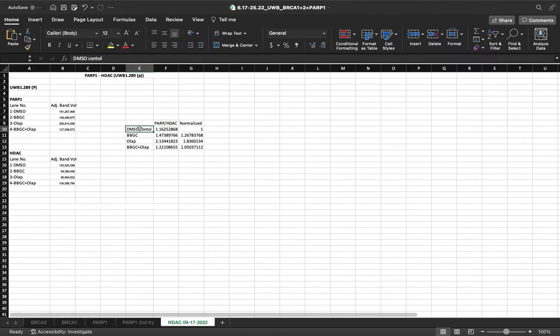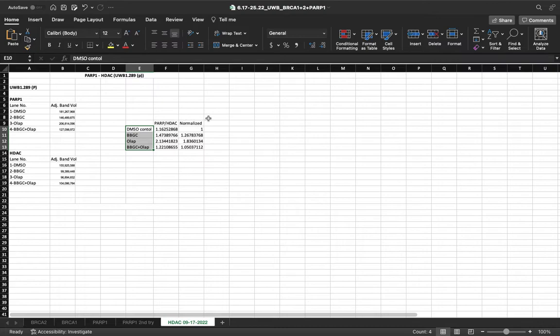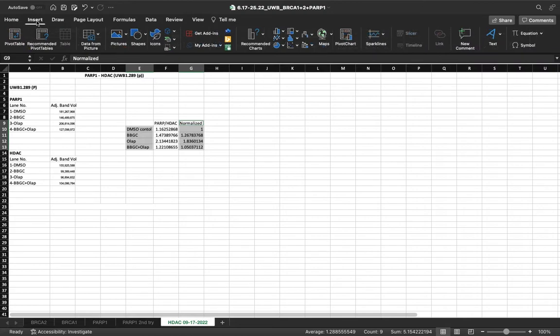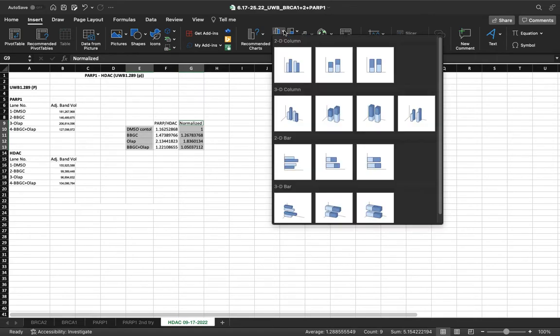You want to select this data, which is the name of each treatment. And we're going to also select, at the same time, the normalized values. From here, we go to insert. You go into charts. We want a two-dimensional bar chart.